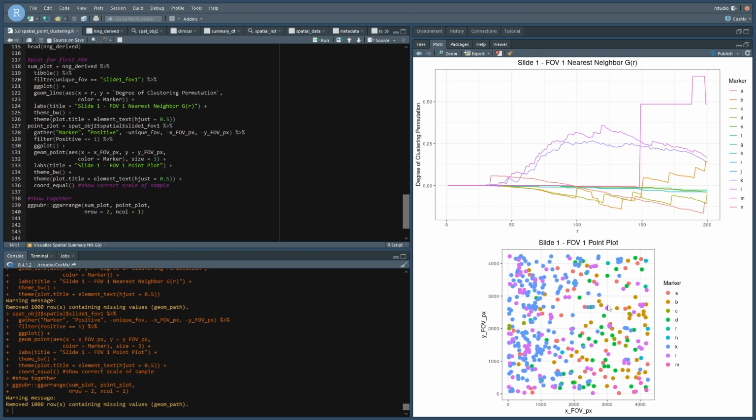So that's biological. Also, we see, hard to tell, L. We see L here that is also clustered with itself. We can see that where there is an L cell, there is a high probability of there being another L cell very close to that, which is pretty cool. Even down here, you can see a straggler here, but we have an L positive, and then there's other L's around it. L positive, another L, L, L, L, L, which is really cool.